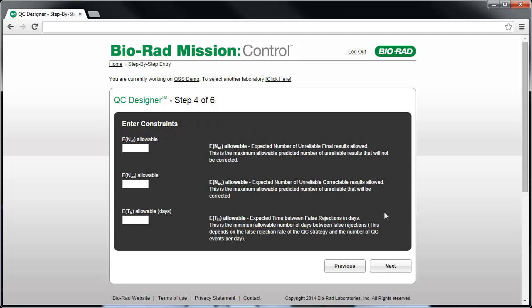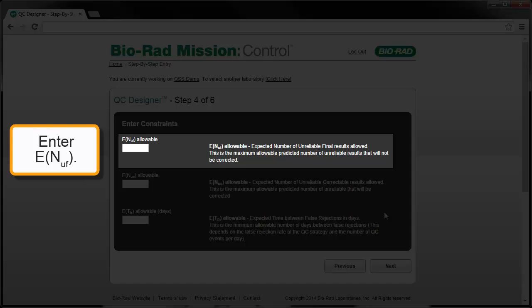In Step 4 of 6, enter your risk targets. The first entry is the maximum allowable ENuf, which represents the maximum tolerable number of unacceptable patient results that might be reported due to an out-of-control condition, but prior to the last accepted QC. We refer to this as the expected number of unreliable final results. While the tendency might be to enter 0 for the maximum allowable ENuf, this may not be a realistic design constraint.